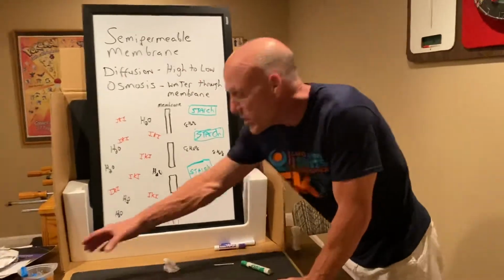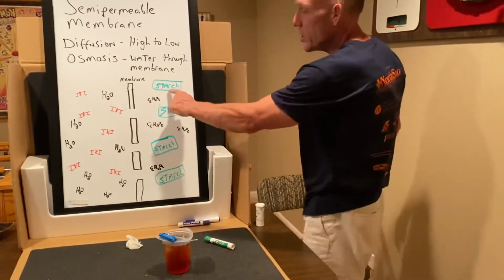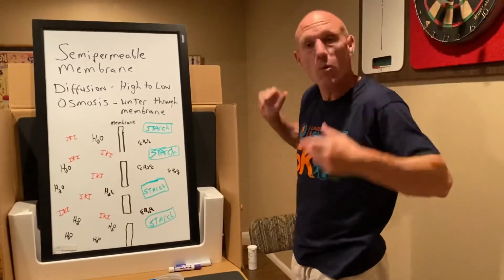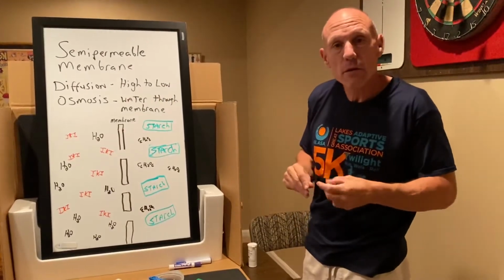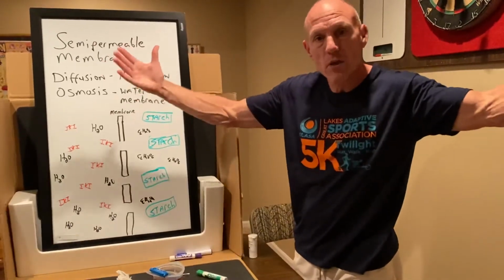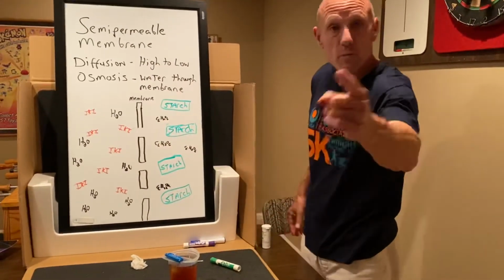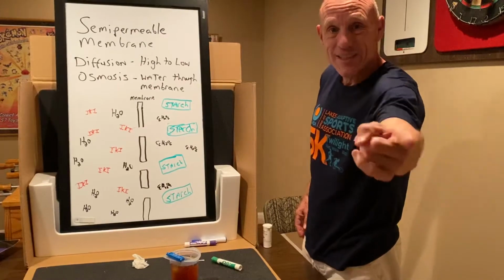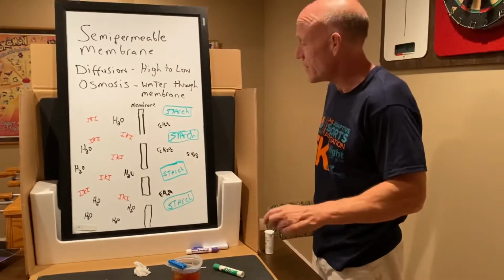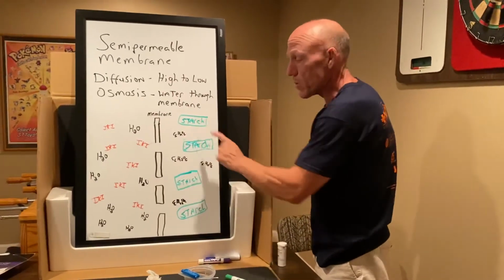Well, if we look at my beaker here, what we have on the inside of the tubing is these big, huge polysaccharides called starch. There should be a mental picture of what a polysaccharide is, right? We don't memorize, but we internalize. By now, that should mean something to you. Big sugar. These littler sugars are glucose molecules. Chemical formula, C6H12O6. Memorize. Right? Memorize. It's the only thing we're going to memorize out of this. Take a bunch of these, you make those.